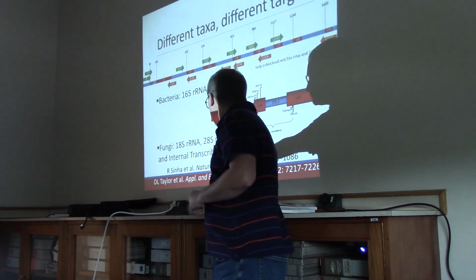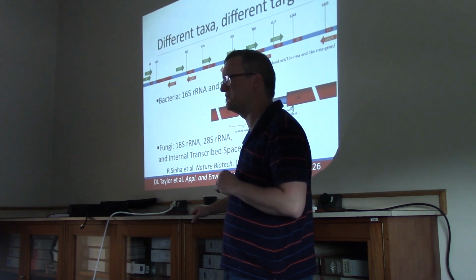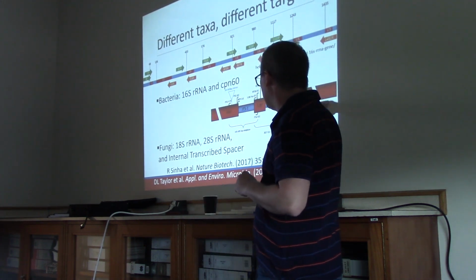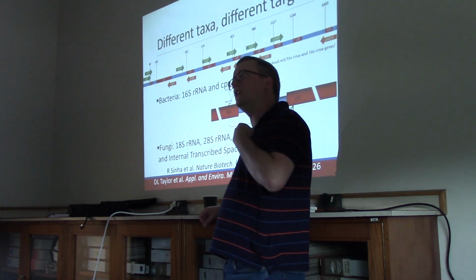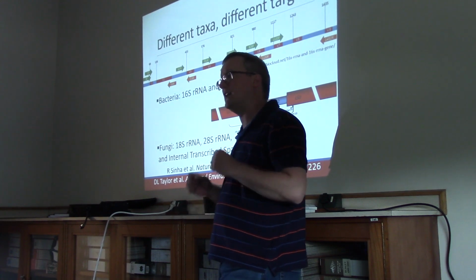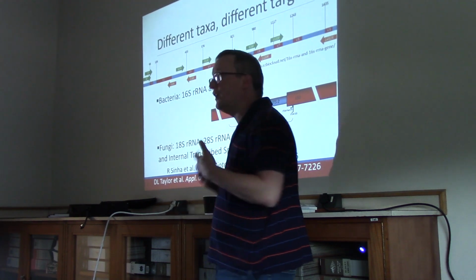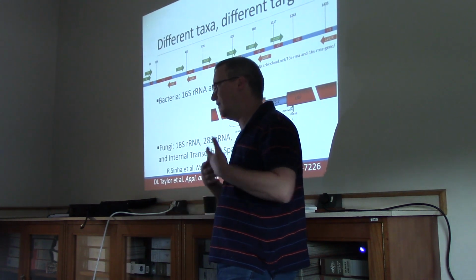So for this, some of them have turned to using the Internal Transcribed Spacer sequence. I've included a diagram here from, I believe, a 2016 paper.